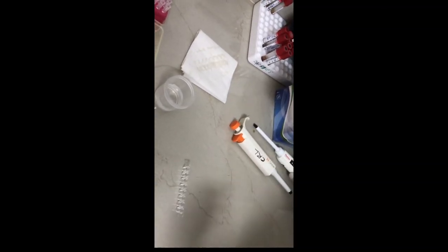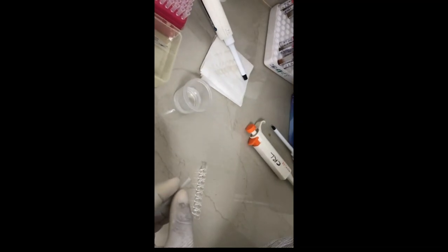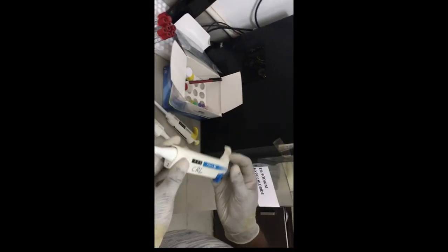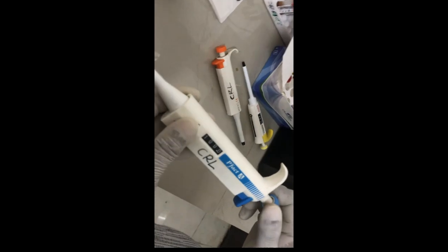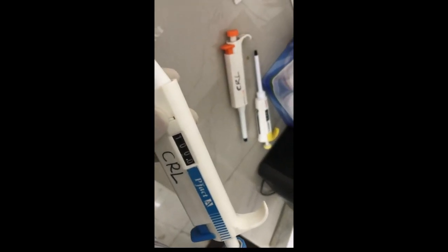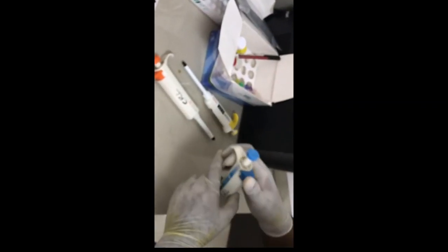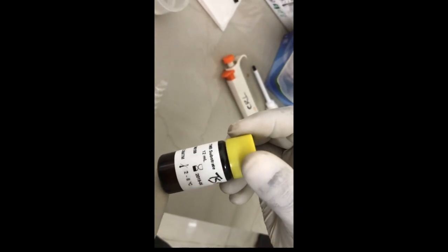We will do the next step by adding 100 microliters of TMB substrate to it. 100 microliters of TMB substrate will be added to each of these wells. Now again we have set our pipette to 100 microliters. This is the TMB substrate which we will add to all the wells.